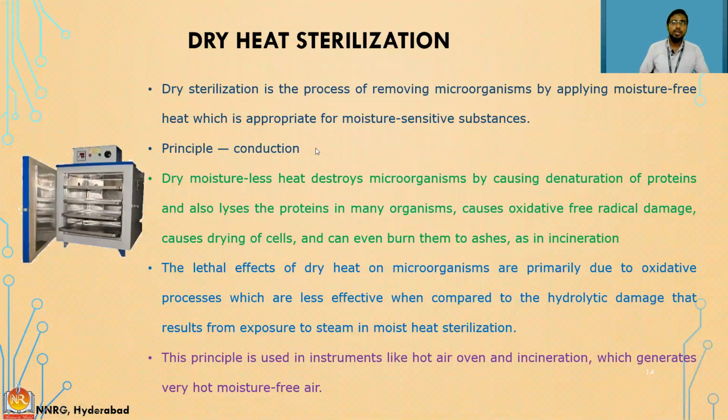The principle is conduction. What is conduction? Transfer of heat from one substance to another, or one object to another. Similarly, in the case of microorganisms, heat will be transferred from one cell to another cell, one after the other. The same amount of constant heat will be passed on. As a result, that microorganism will face death.